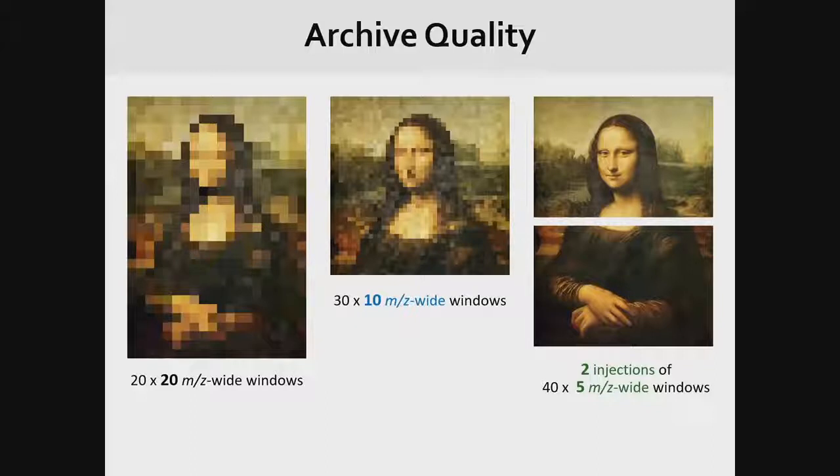So what this basically means is that if we were trying to come up with a permanent molecular record of the Mona Lisa, what we're effectively doing right now is collecting a permanent record like this. So the data is not collected at very high resolution. It's really hard to even make out that there's a painting of a person there. We could collect the data at higher resolution, but we probably couldn't span the total image. So we're probably then only collecting at a higher resolving power, but having only a portion of the total image.